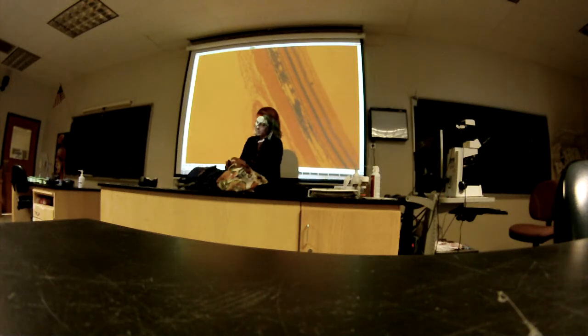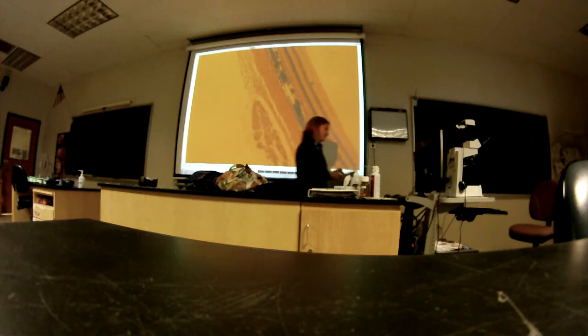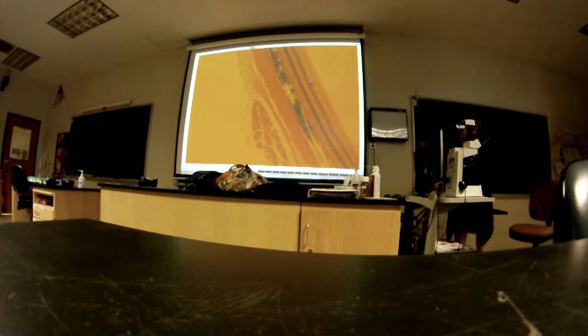Okay. The innermost is the cornea. Hmm? The innermost one is the cornea. The innermost one is the retina. Oh, closer. Retina. Okay, retina.